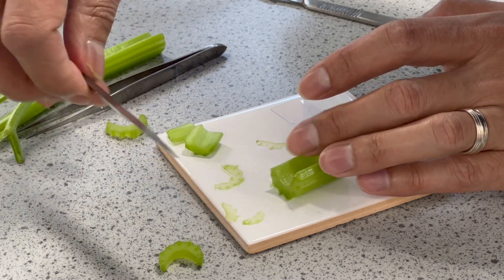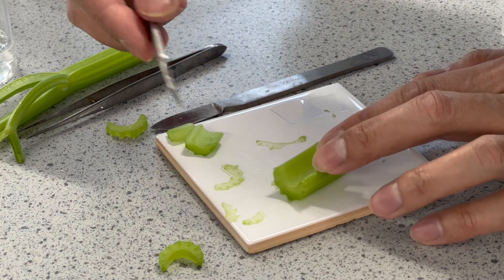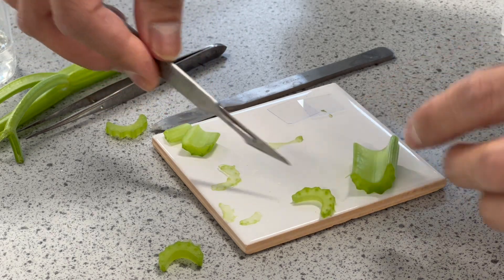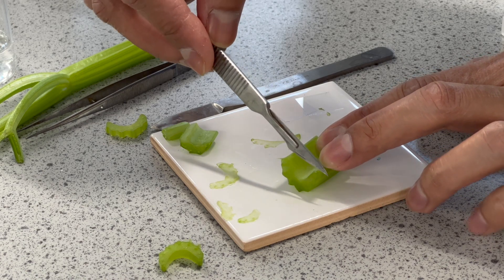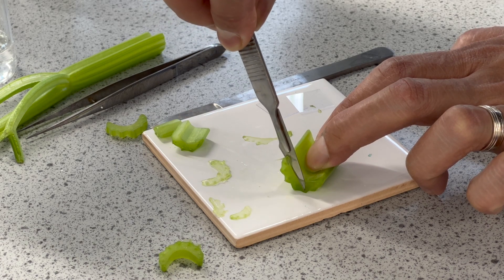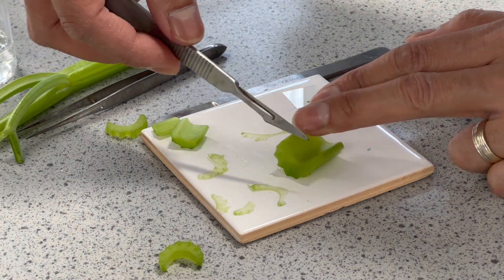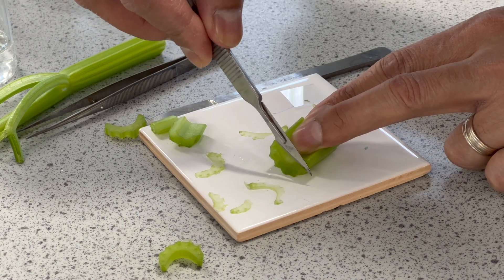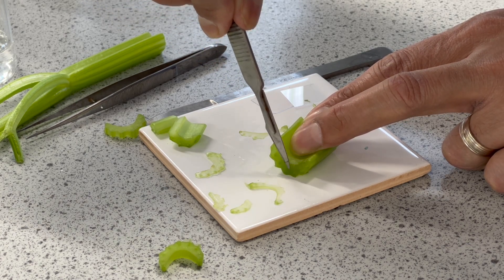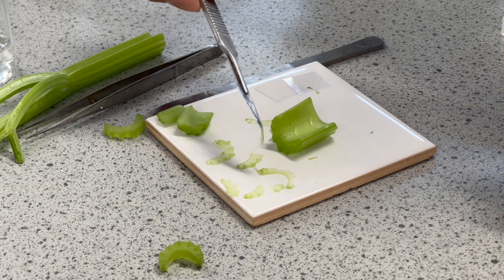I have a scalpel with a sterile blade, so I'm going to use that to cut off the rough bit and then make the thinnest section I can. For light microscopy, it is important to get the thinnest possible layer because the light passes through the sample — the thinner the sample, the more information you'll get.